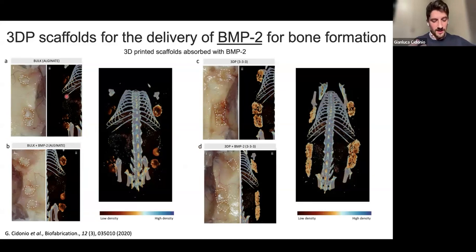We know that material, and for those of you who are not familiar with materials, this is alginate, and alginate comes from algae, and it's well known to be self-mineralizing in vivo, in subcutaneous implants in mice. You can have some mineralization you see on the low density, but not extensively for 4 weeks. But if you 3D print this material and you combine it with other materials like nanoclay, this laponite, you really find an interesting way of modulating the bone formation.